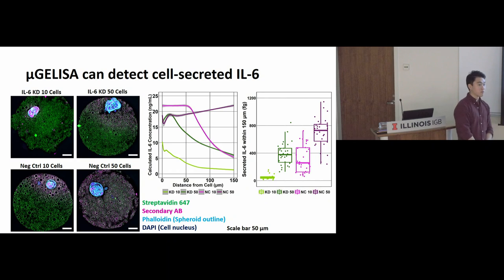So that was another idea I had before, where you actually tag the different types of ECM-linked microgels with a certain type of fluorophore. So you can track which microgel the cell is interacting with, and then maybe see, oh, is it interacting with these two types, then it expresses this. Now I kind of got rid of that idea just because the microgels are so small that the cells are going to be interacting with so many microgels. You can't really quantify it, and also adding the fluorescent tag gets rid of the fluorescent tags I can use for analysis. So there's different pros and cons, but definitely mixing and matching the sensors with the ECM-linked microgels. That's the main advantage of microgels.